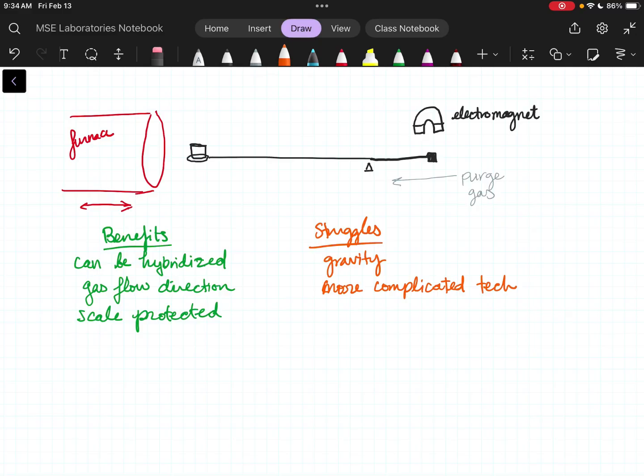Does the main data processing happen at the board that has the electromagnet control board, or does it just say here's what voltage I'm pumping into it, and then it just has something that makes it work right? Like the sensor and the magnet are integrated, and it's just like a PWM circuit. I don't know the details of our circuitry.